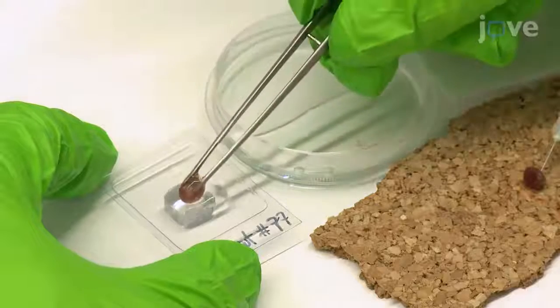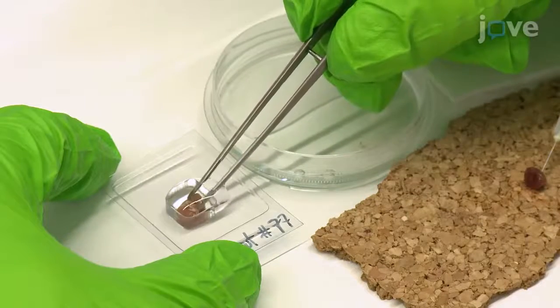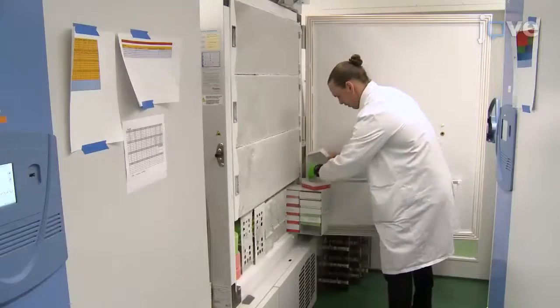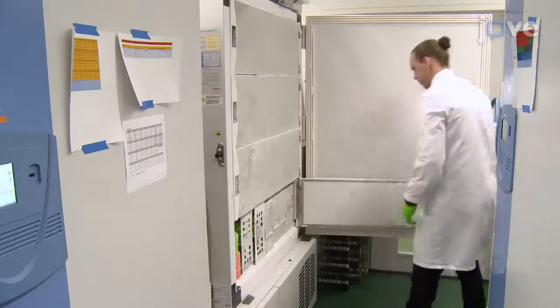Transfer the specimen to the bottom of a cryomold filled with OCT with the aortic root perpendicular to the bottom surface and freeze the compound on dry ice. Then store the tissue sample in a freezer bag at -80 degrees Celsius until cryosectioning.